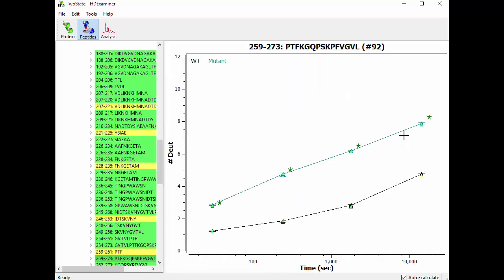And in fact, if we click on it, we can see that in fact all four time points for this peptide show a statistically significant difference.